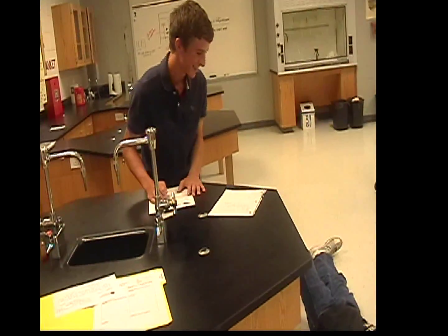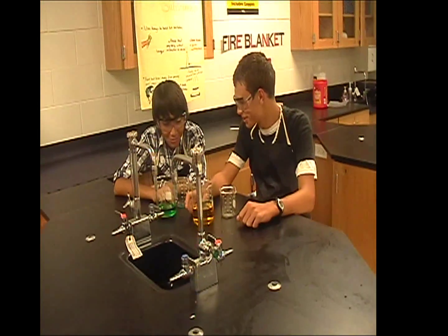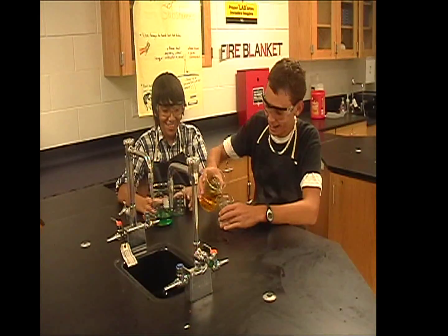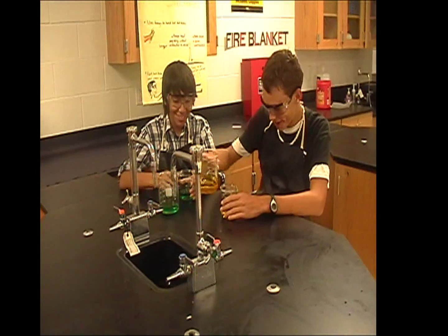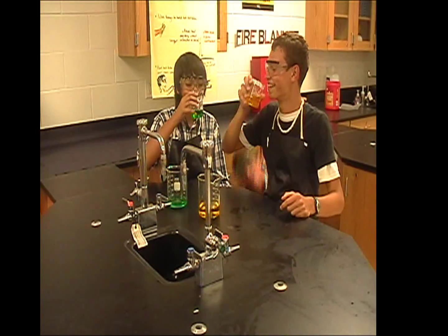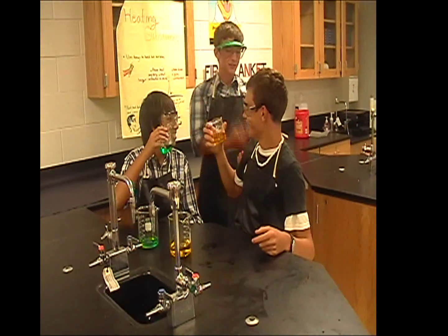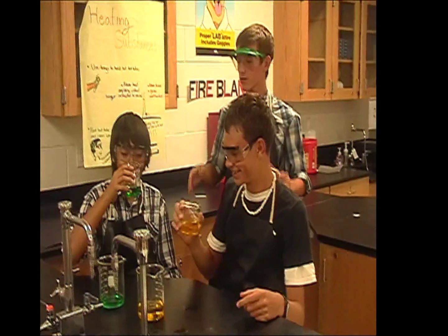A bystander reacts: 'I hope that doesn't happen to me.' Then a correction is given: 'No guys, don't drink those chemicals — they can cause damage to your body. If you guys are really thirsty, just drink water.'